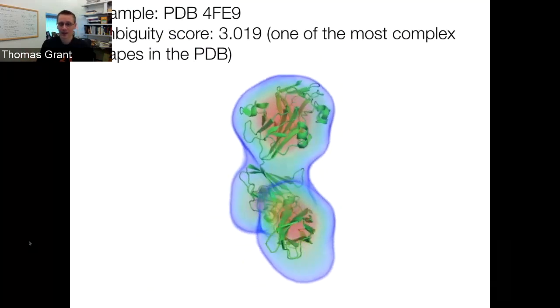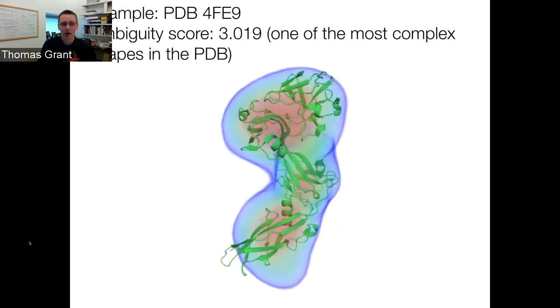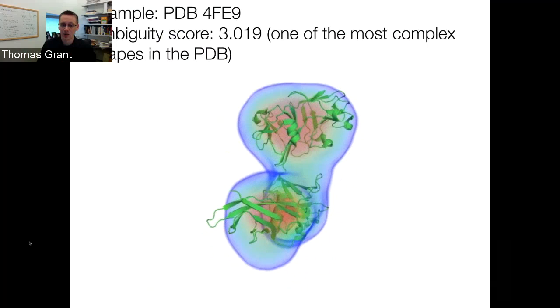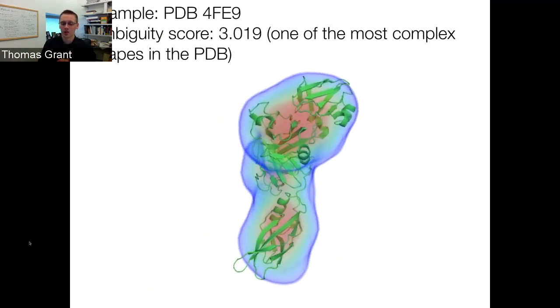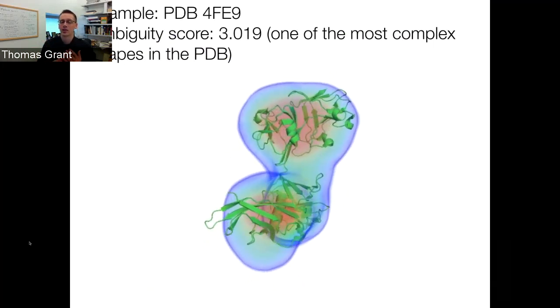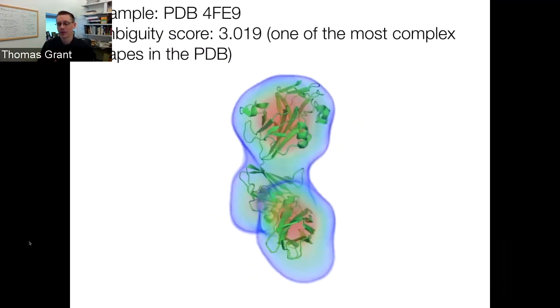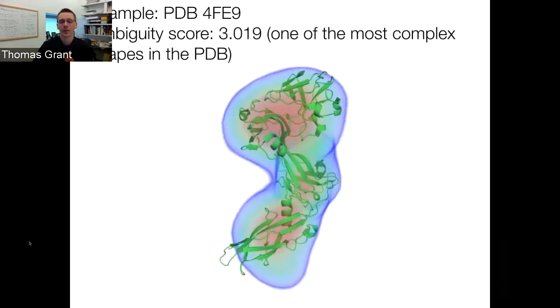In that case, you would end up getting some kind of average that was incorrect. So we now have the ability in DENSS to flip each of the reconstructions over all the different axes, and then average them such that they all have the same enantiomer. Now, it may not be that they have the correct enantiomer, but at least they have the same enantiomer.